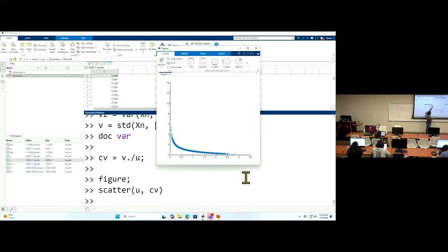There's one gene, for example this one, that has a very small average but a really high CV, and then there's another one. But for genes with a high expression level on average, in this range, they have a very low CV. So these two variables that characterize the genes' average expression and their dispersion are linked somehow, okay?